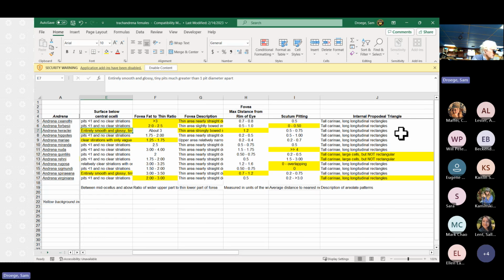Just checking on my other thing. Got a lot of pollen on it. Let's try another. How about that one? That seems reasonable.